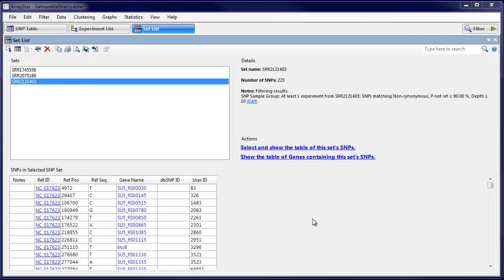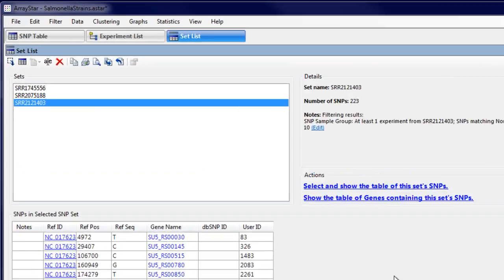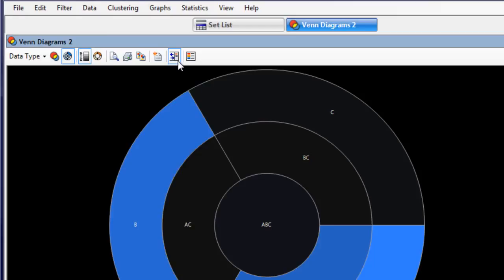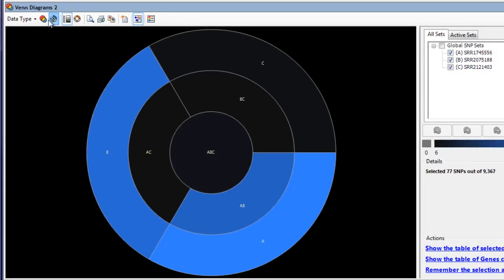After identifying SNP sets of interest, you can use Venn diagrams to visually compare the sets.